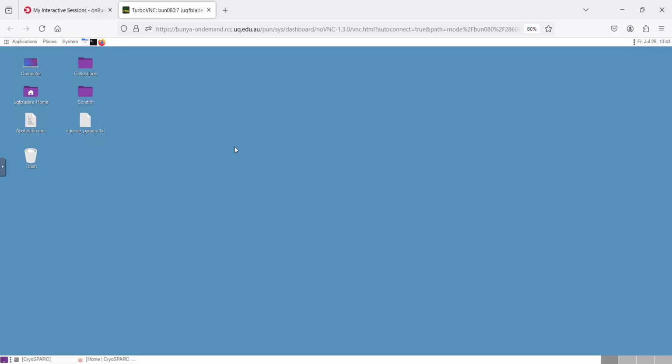Okay, let's get started with CryoSPARC. So CryoSPARC is a lot more user-friendly, I'd say, than RELION, but that comes at a cost of not being as customizable. So I think the two work really great hand in hand. It's definitely worth learning both.